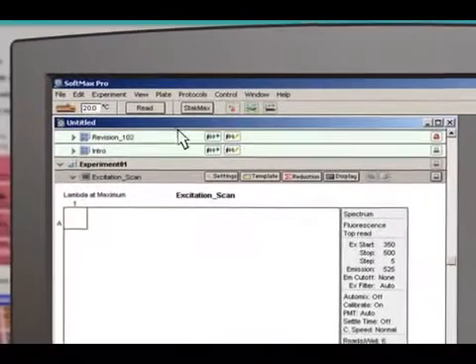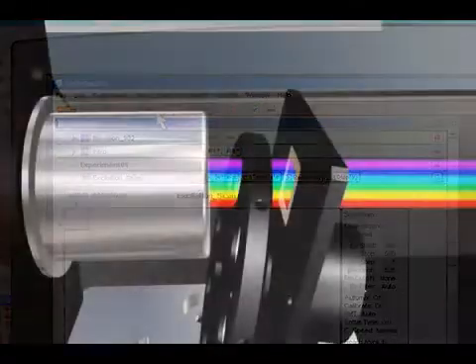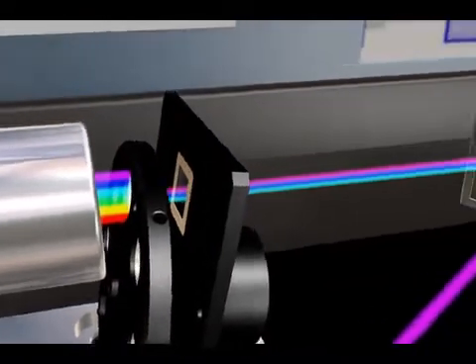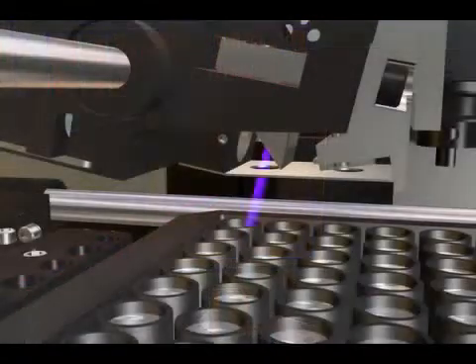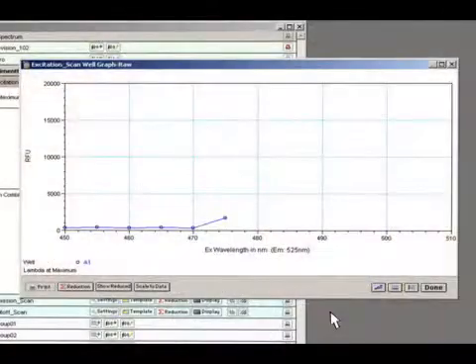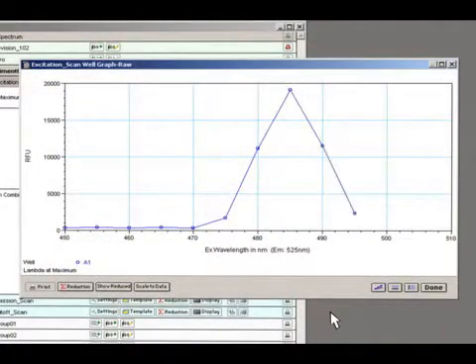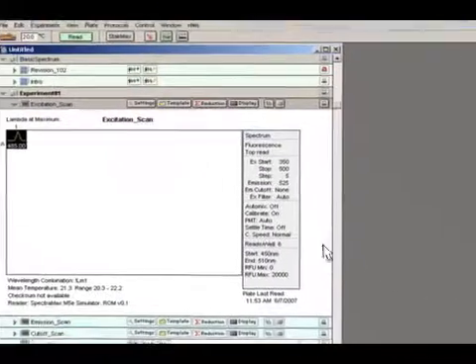Once you click Read, SpectraMax automatically selects the proper cutoff filter and scans the monochrometer through the selected excitation wavelength range. This raw data is processed by SoftMax Pro and we are presented with a real-time graph of the results, complete with the excitation maximum.